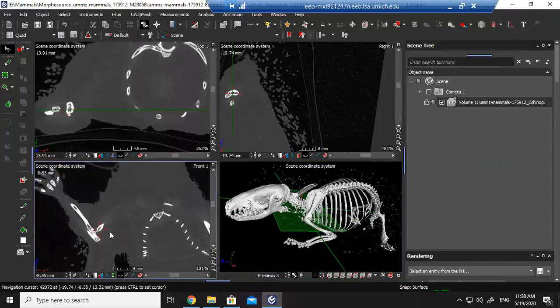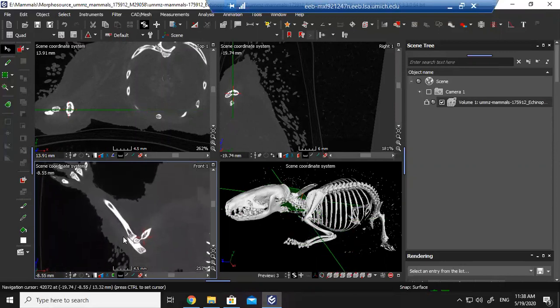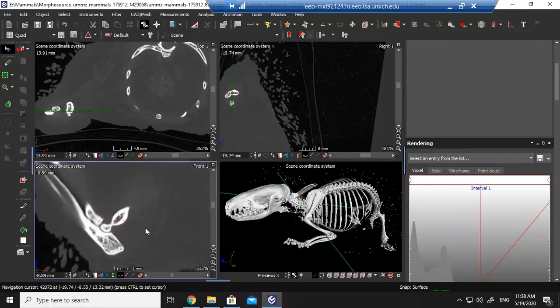So for today, I'm going to start with the drawing tool because firstly, I think the drawing tool is the best tool for this sort of work, as it allows you to have the most precision. And secondly, I think really with the drawing tool, you get the most freedom as well. We'll go into the region growing tool shortly after that.